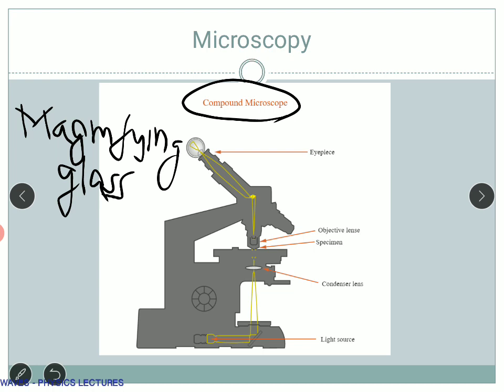In a compound microscope we are actually using a number of lenses in combination to have an enlarged and more focused image. So when we talk about a microscope, this factor of magnification and resolution comes into the picture. We have already learned that, but anyhow we are going to have a look at another slide on that also. If we look into a basic compound microscope, what it has is just an eyepiece.